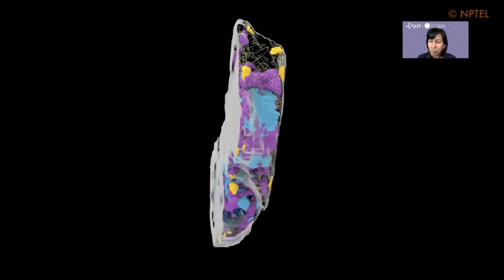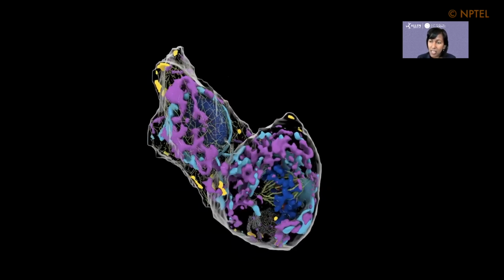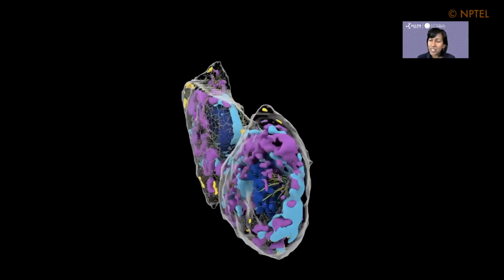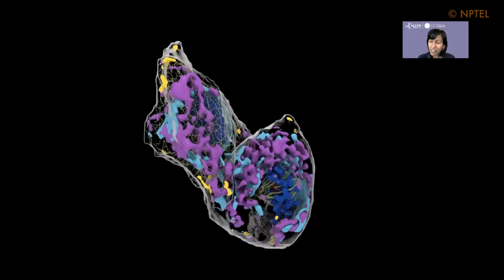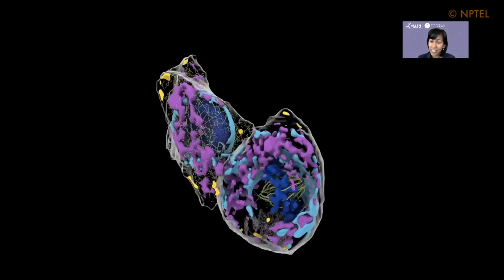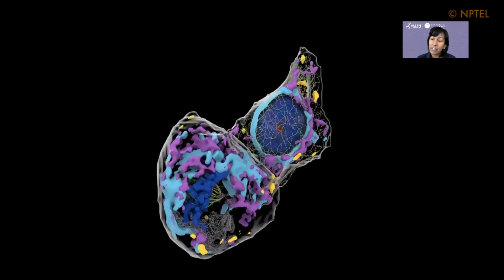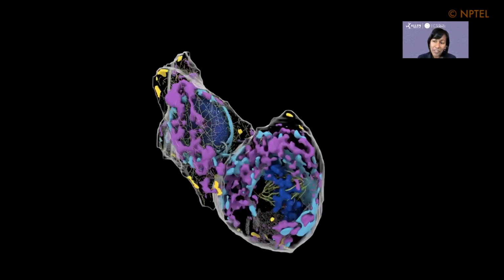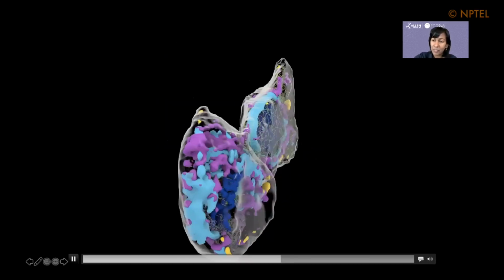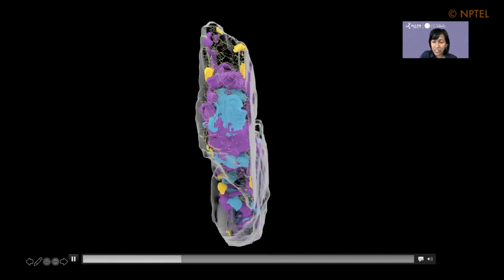And I want to show you one example. So today I didn't go over the computational pieces that allow us to take one structure and combine it with another structure. So here's one example. These are two cells from a colony that were sitting next to each other. So this is real data in terms of the morphology and the cell. But the only thing that was tagged in those two cells is what you're seeing in green here. So one cell is in mitosis, you can see, and the other cell is not in mitosis.